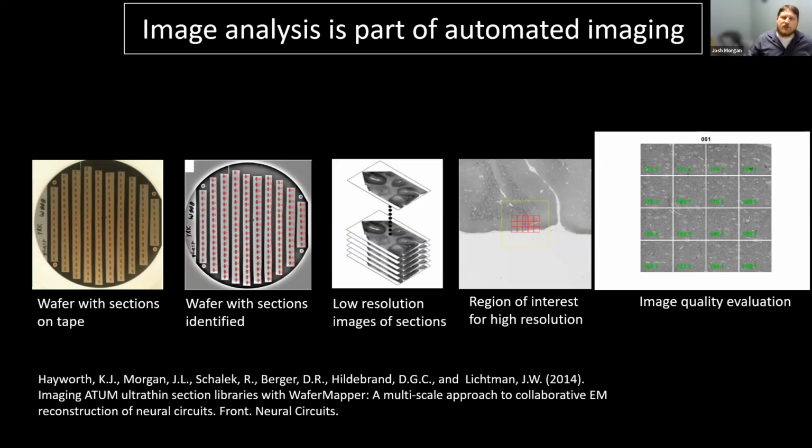But it also just allows us to monitor how the image run is going and look back on previous quality of imaging series. So, this wafer, we might do an imaging series that takes 24 or 48 hours. Before we pull the wafer out, we can do a quick run through this stack of pre-stitched images with the quality evaluations and make sure, did it really image the area it was supposed to image? Were there any problems? Was there drift in signal to noise or focus that we need to go back and retake some images or address some issue with the microscope?